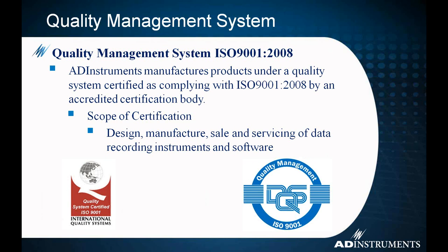I also have people ask me, how do I know that what the PowerLab is telling me is accurate? AD Instruments is certified by the ISO 9001 quality management system. We spent quite a bit of money to get certified this way, and this is our handshake with you, our verification that we design, manufacture, and service our data recording instruments and software according to this standard. In other words, we follow this standard so that you know what you're getting out of your PowerLab is really what's being input to it.